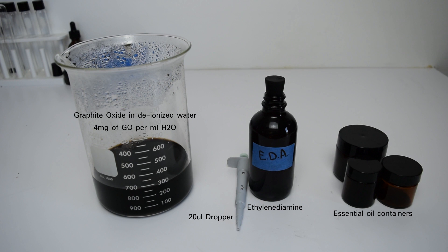I chose these essential oil vials because they have a wide neck to release a hydrogel easily.